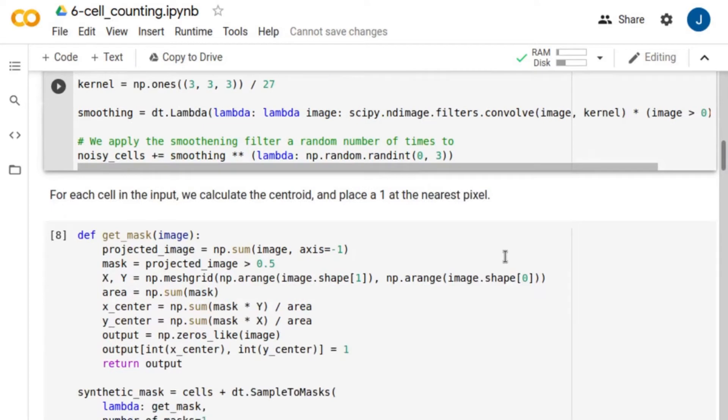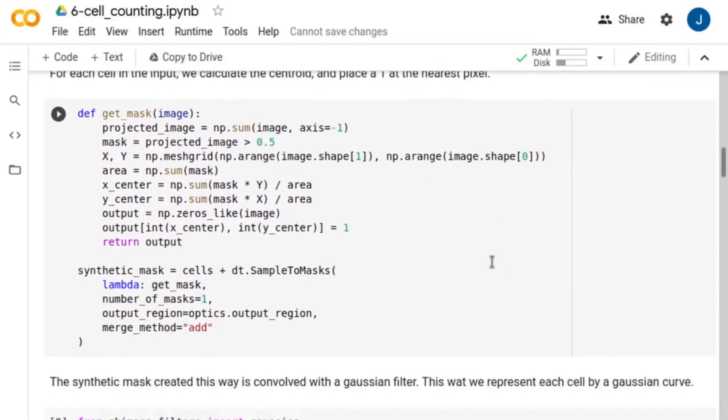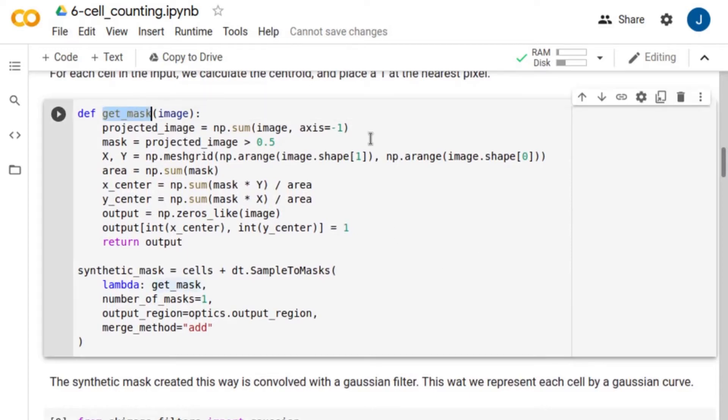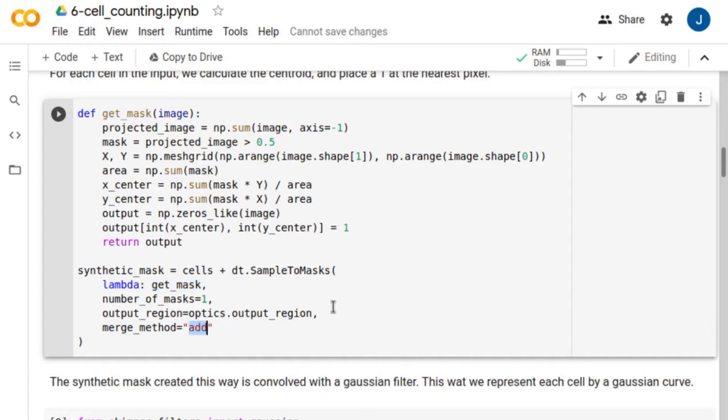Now, we need to generate labels for training. To do this, first, we define the getMask function, which computes the center of each cell and assigns a 1 to the nearest pixel. To create the masks, we use the sampleToMask feature. The input to this method is the getMask function. Note that we use the merge method with the option Add, which adds the masks together.